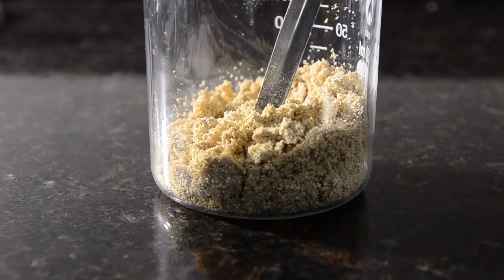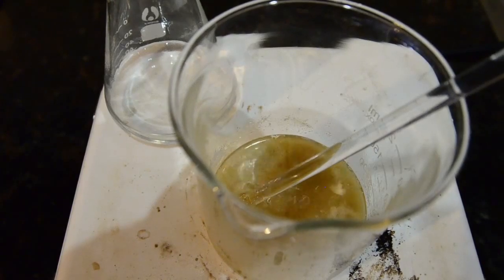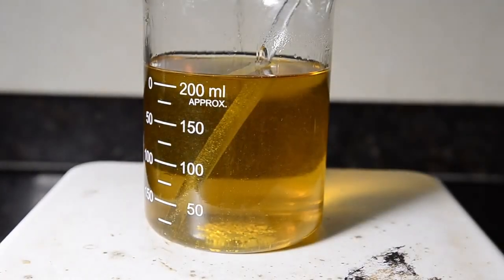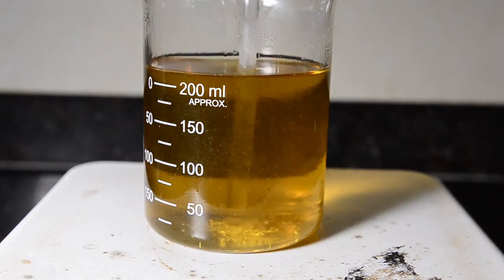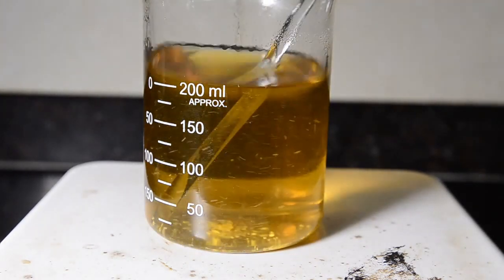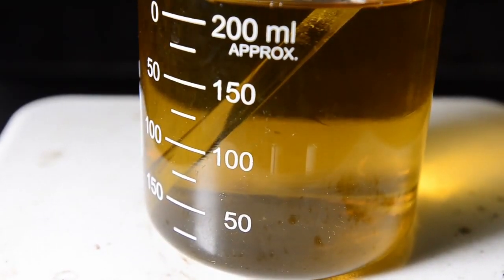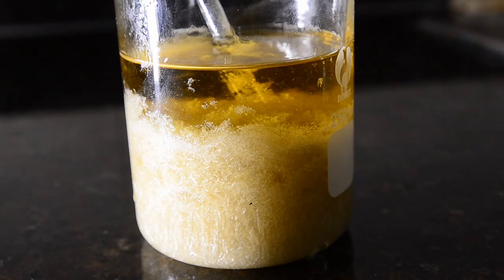After a few days it had dried fairly well and was ready for recrystallization. We recrystallized using a boiling mixture of 20% ethanol and 80% isopropyl alcohol. The solid took around 200 ml of boiling solvent, but dissolved completely without any residue. On cooling for 2 hours, massive needle-like pale colored crystals were produced in the solution.